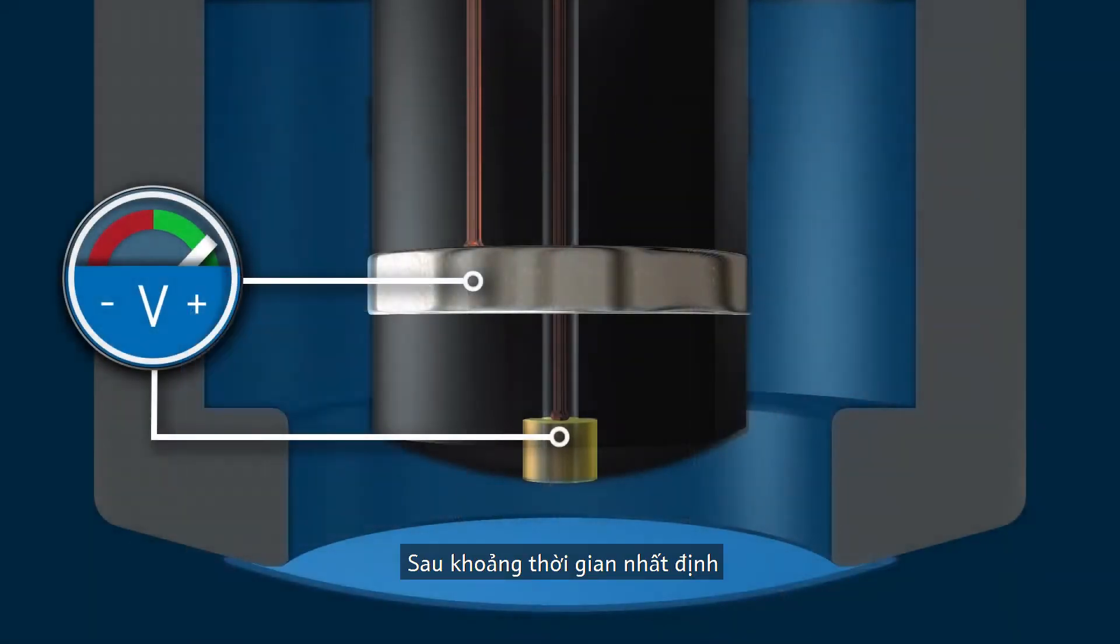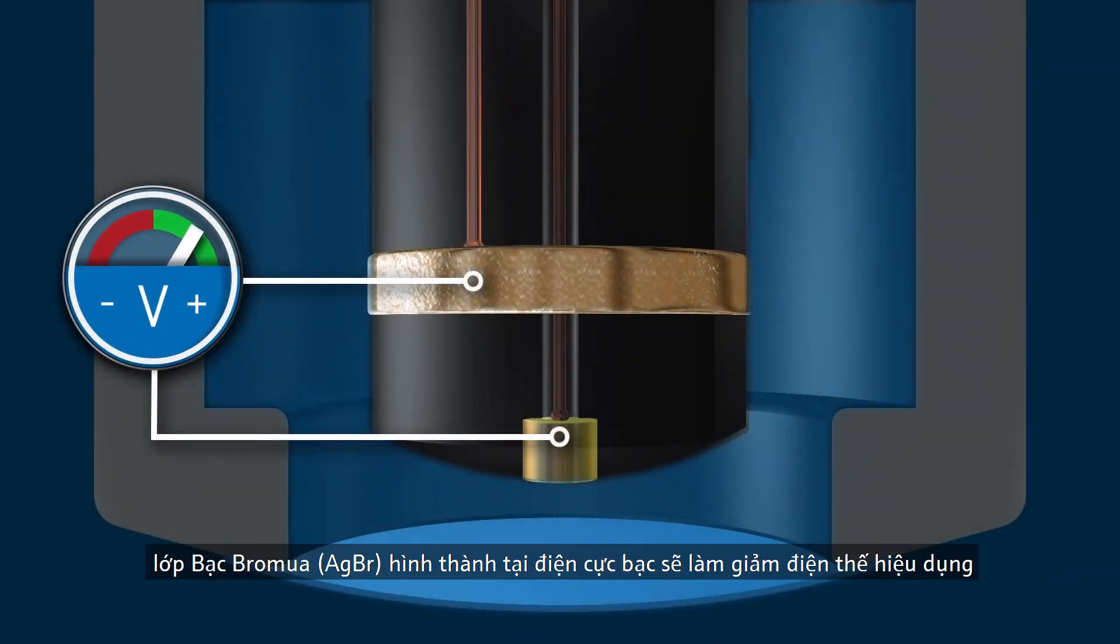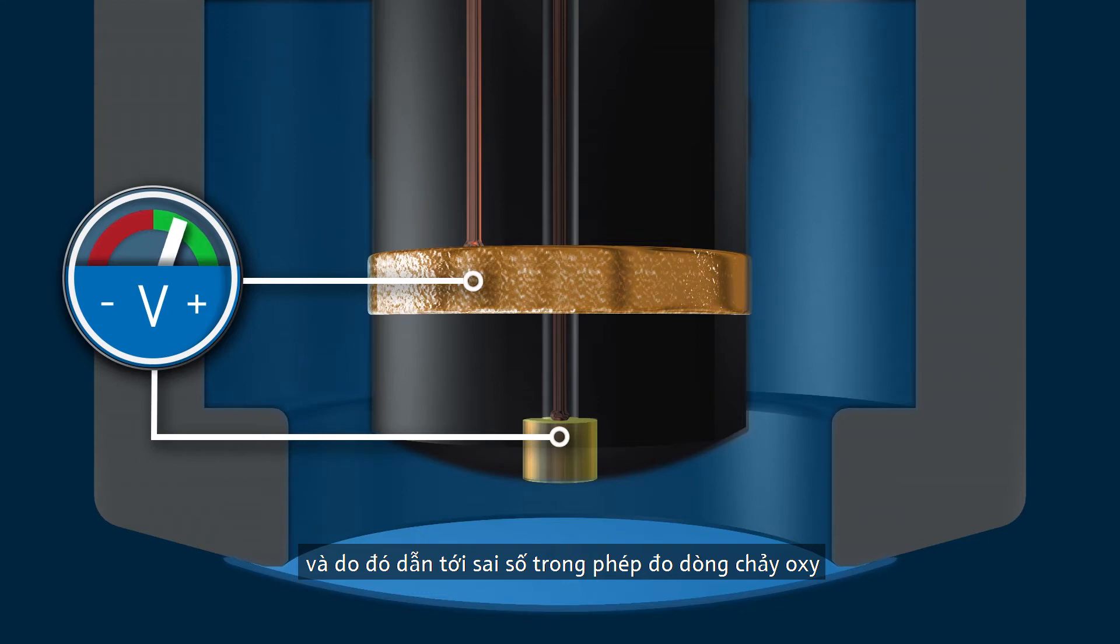After a certain period of time, a silver bromide layer forms on the silver anode. This layer reduces the effective voltage and thus the oxygen flow, which can lead to measurement error in applications with high temperatures during cleaning or sterilization.